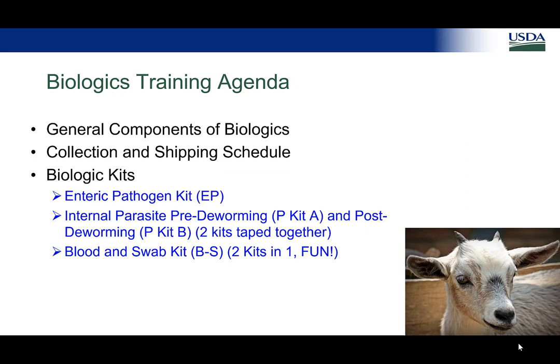All right, in your manuals, you'll find a biologic section. You might want to flip to that. It's towards the end after the questionnaires. I'm going to kind of go through it in order, I think. We're also going to watch some training videos either at the end of this or tomorrow morning, and we're going to cover more details about how to collect the samples at that point, too.